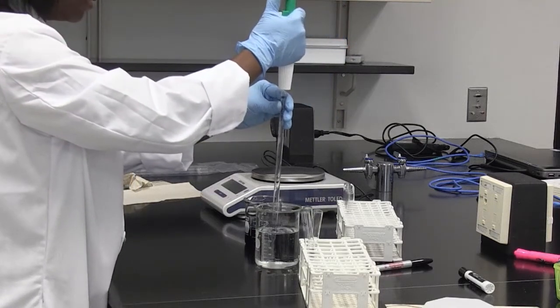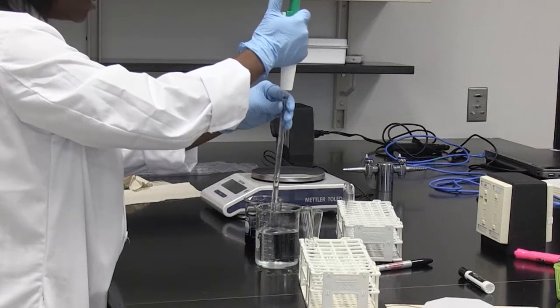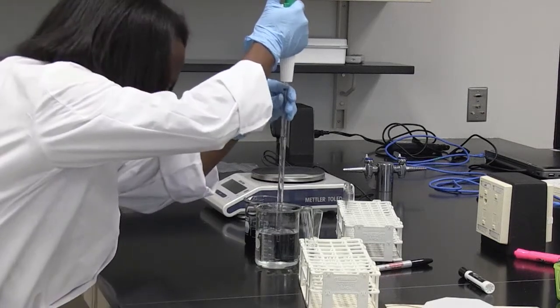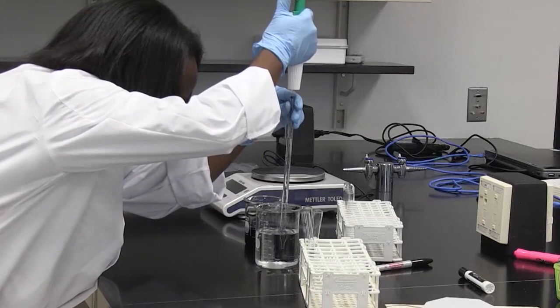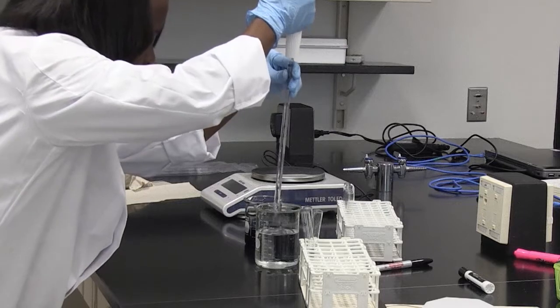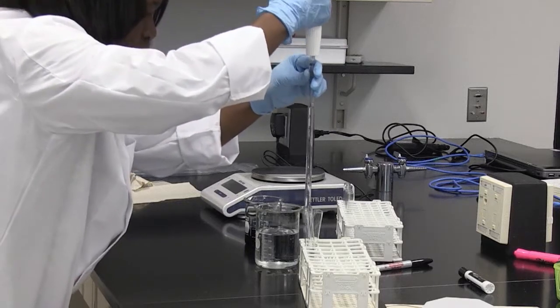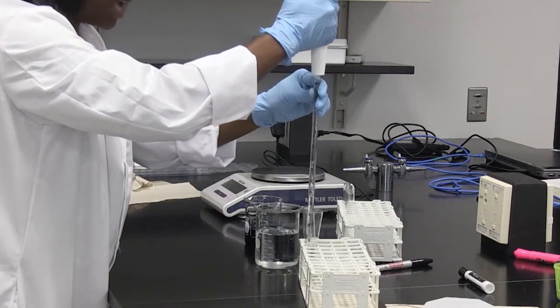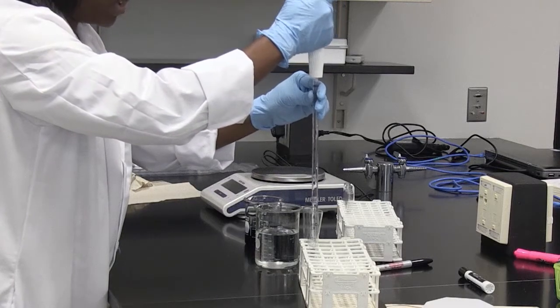Then to the last test tube, we're going to add 9.9 ml of water, and we add this to our test tube.